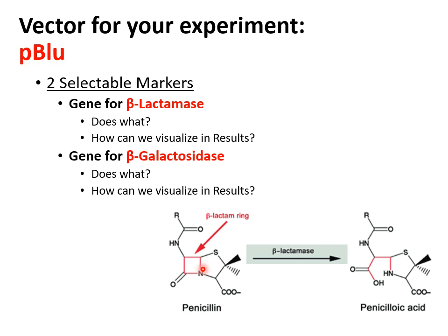Okay, so as you can see in this figure, beta-lactamase cuts the beta-lactam ring of certain antibiotics so that now that antibiotic is in an inactive form, okay? Because normally antibiotics like penicillin and ampicillin, for instance, use that beta-lactam ring in order to bind to the enzymes that help the bacteria build their cell walls.